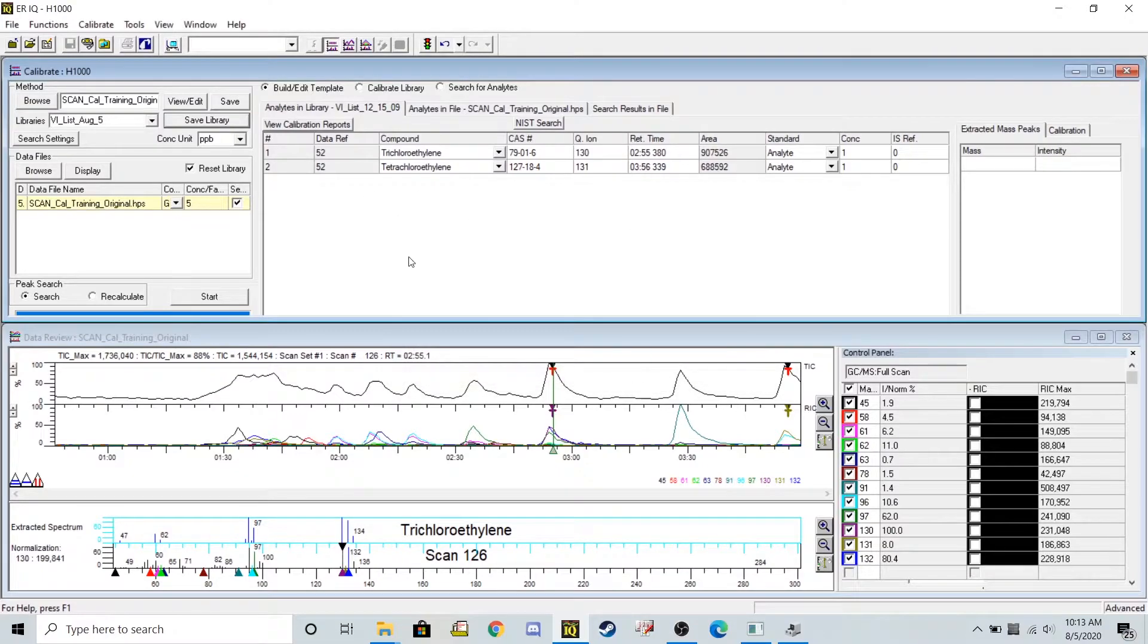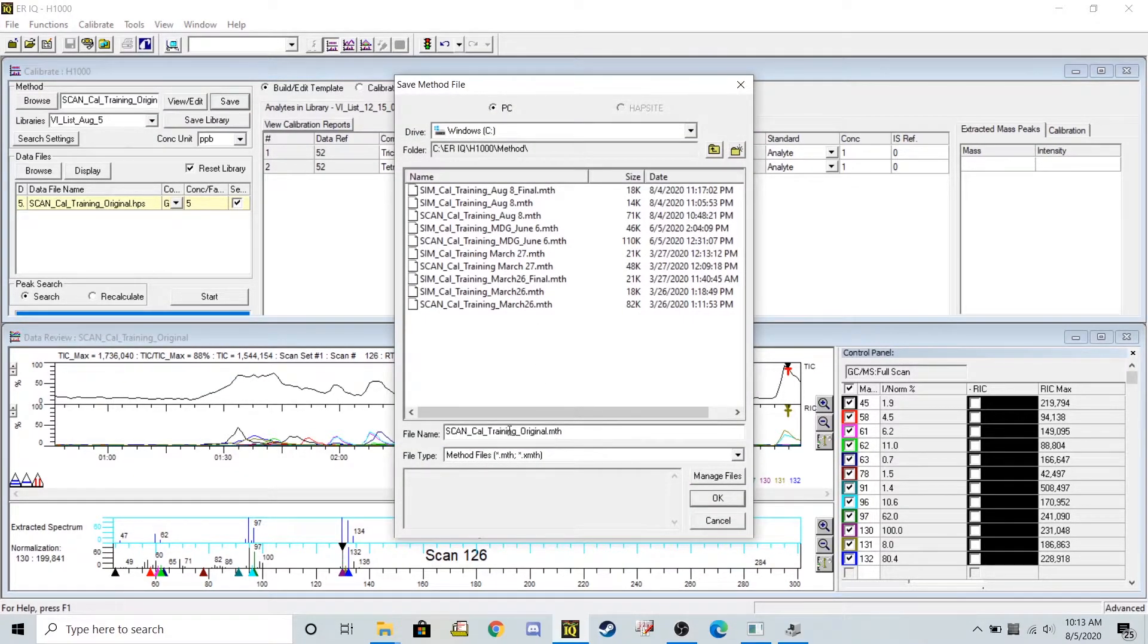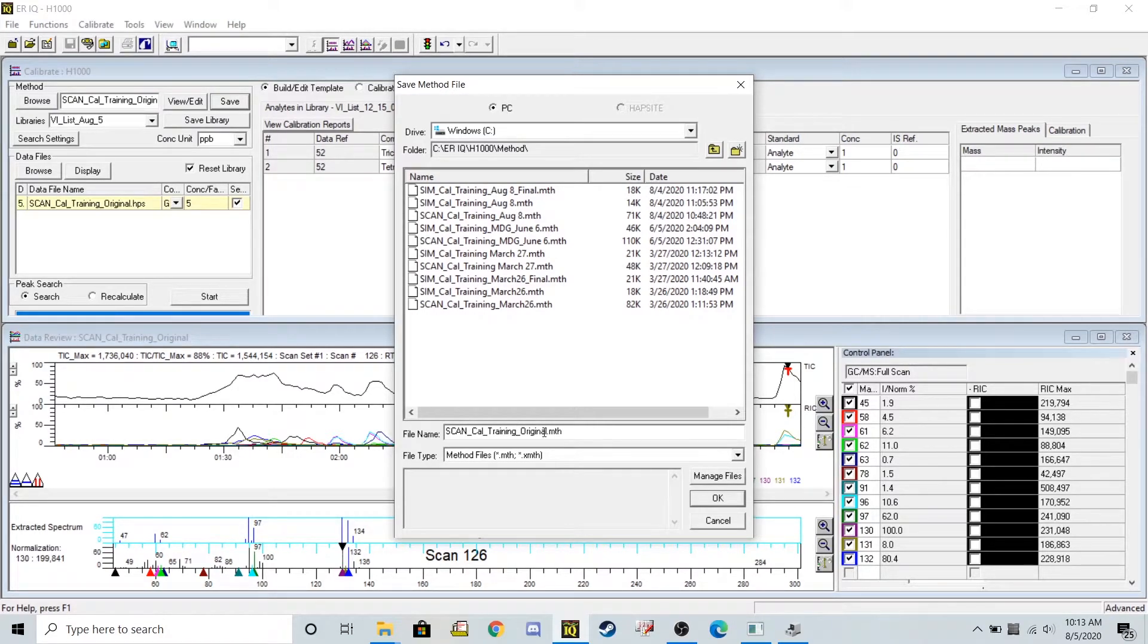And then I'm going to also save this method. So this is still a scan cal training. That's what we're attempting to do. But I'm going to also call it August 5th.